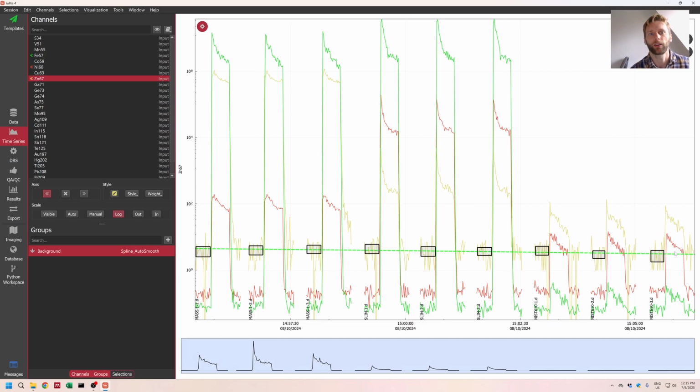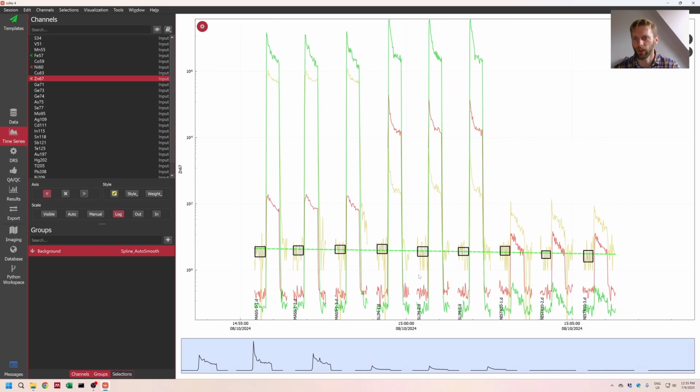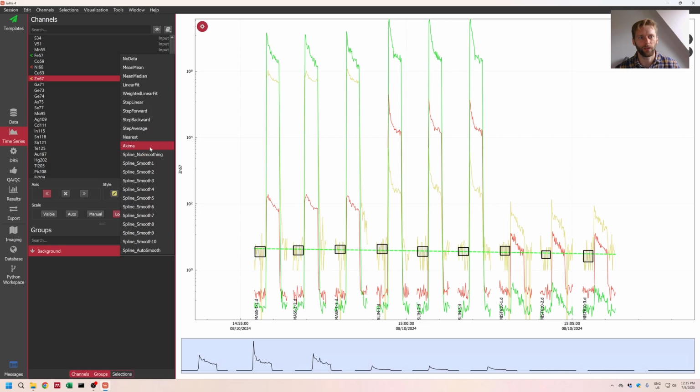You'll see what happens, but that's the important thing. And we want to make sure that this looks like it's doing something that makes sense. This looks okay. Let's see if I can make it do something crazy.